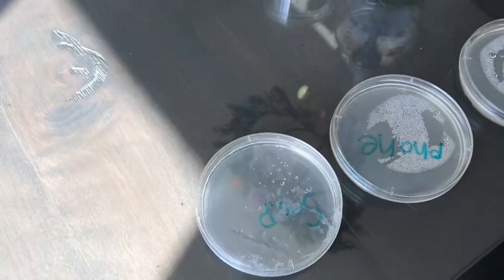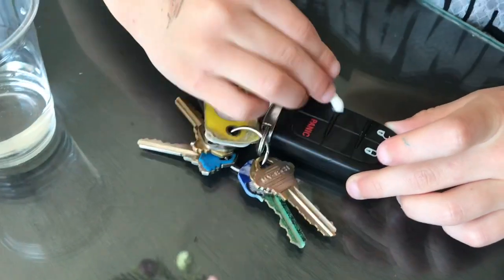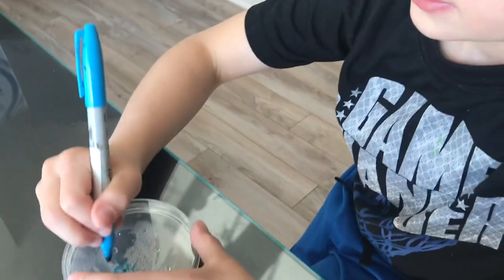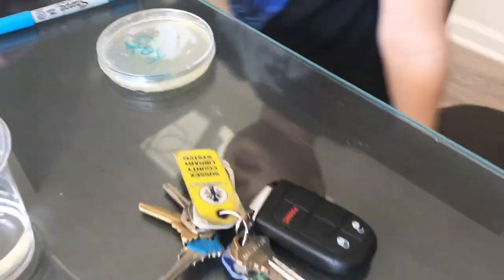Let's do the last one. You use keys a lot. We do use keys a lot. Let's do the keys. Okay. Dip it. K-E-Y-S. Good. That's the last one.